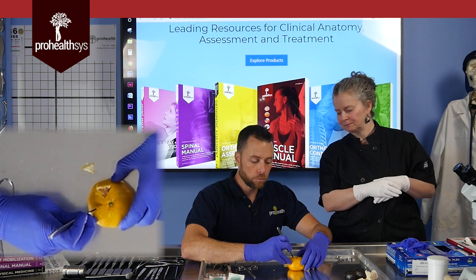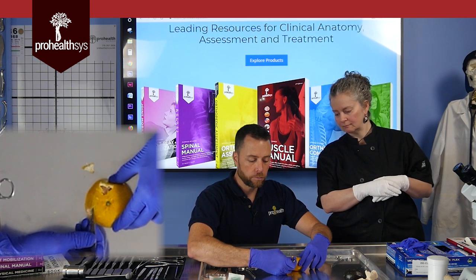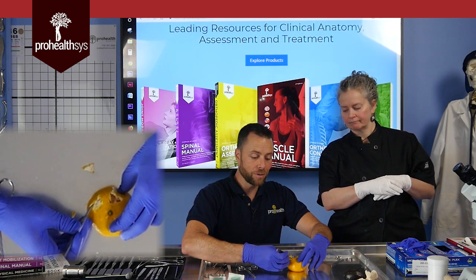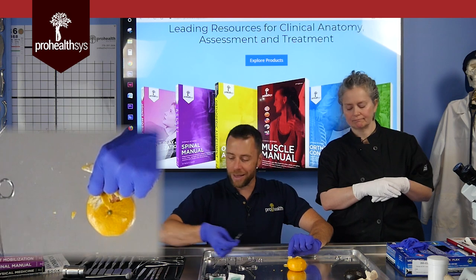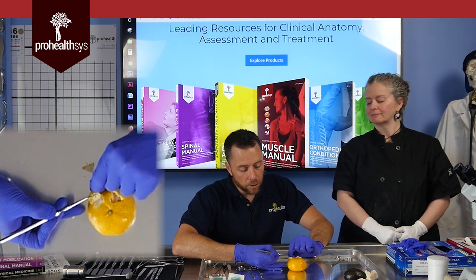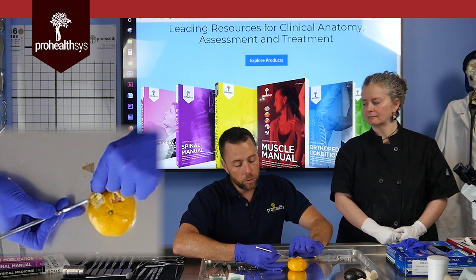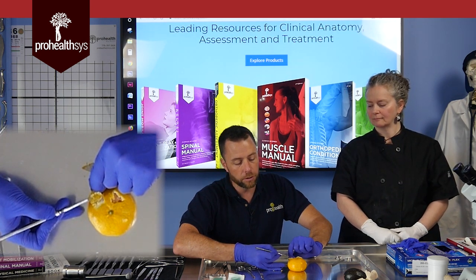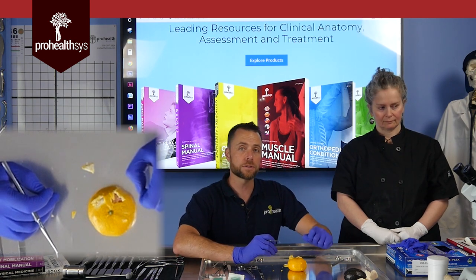If I do my incisions to start off the edge and start separating through, you can see the layer of whiteness below. We've had students spend hours before asking whether they were too deep — all they had done was separate layers superficially within the skin itself. Using the probe, you can do a stroking action to separate out — as on our donor — the superficial fascia and skin layer using gentle movements. This kind of fine work is best learned with experience, and we'll show you more in the lab.